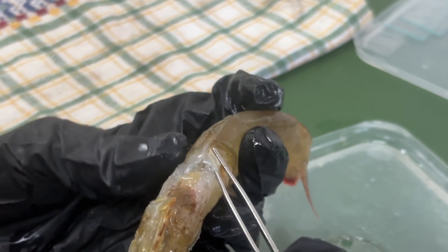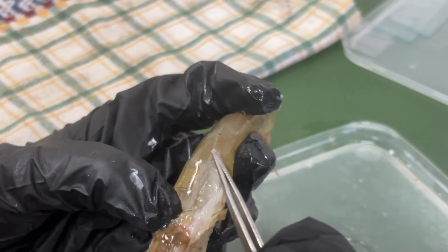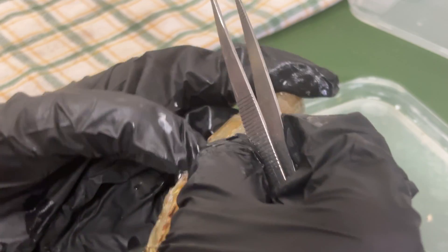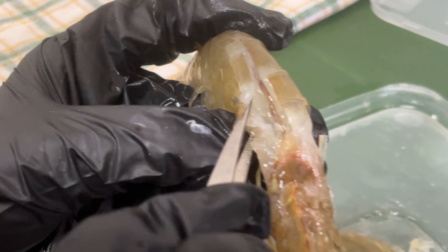The hepatopancreas is also the part we often check to detect diseases. Many infections, like EHP, white gut, or bacterial infections, show symptoms in the hepatopancreas first.